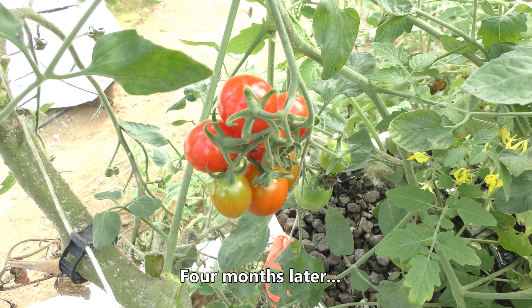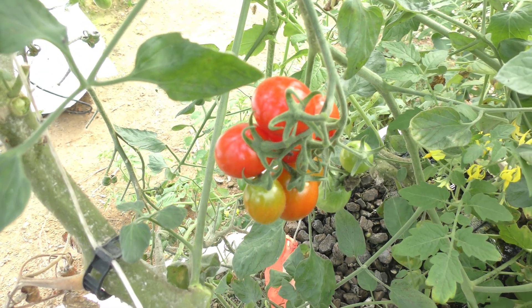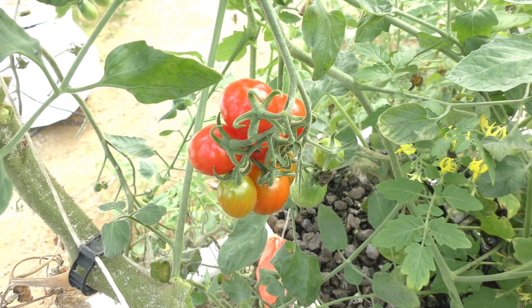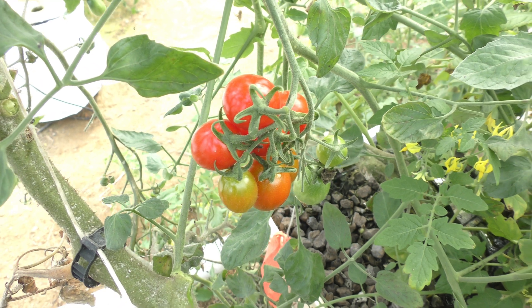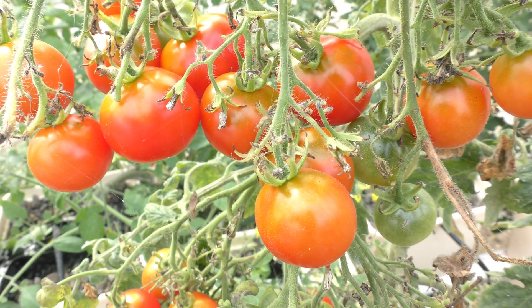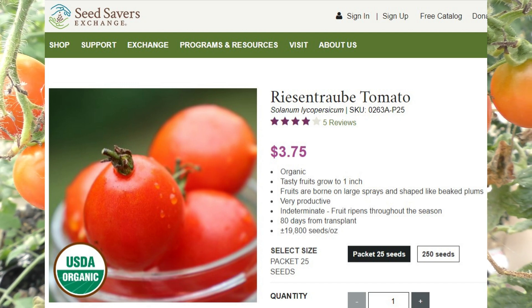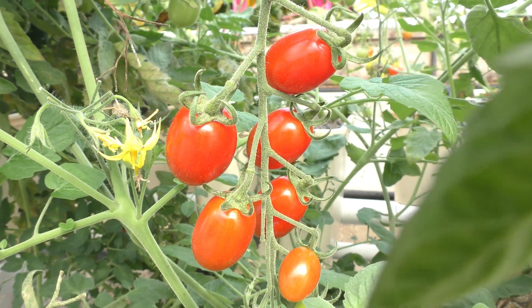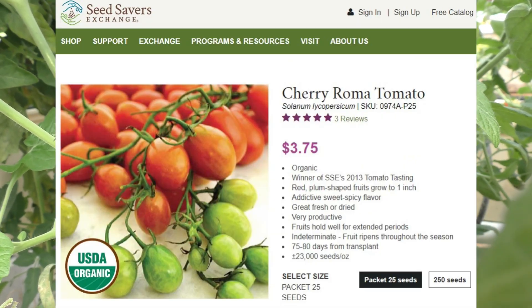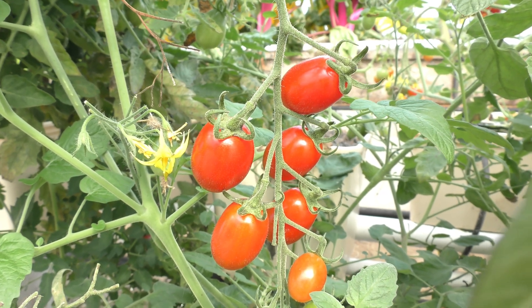I've procrastinated making this video, and I now have tomatoes available, so we're going to test out some of these tomatoes. This variety is called, somewhat inappropriately, a Mexican Midget — it's an heirloom seed and I didn't name it. This one I don't recall the name of; it starts with an R and it's very long, so I'll put the label on screen. And my favorite is this Roma variety. I'm guessing that's going to be the sweetest, so we'll have a little showdown between the three tomatoes.